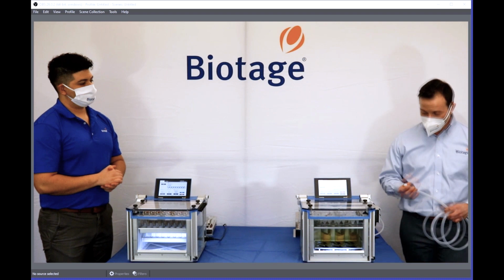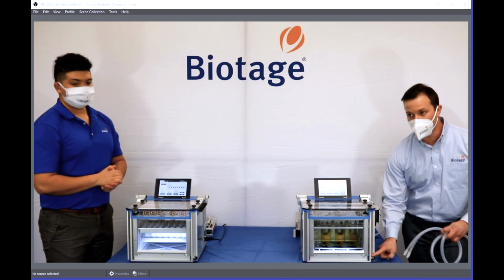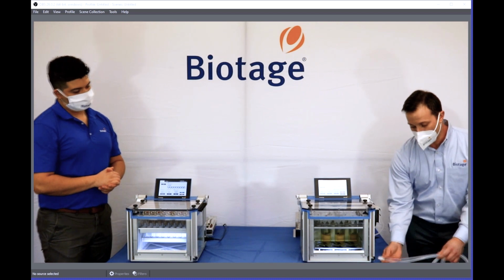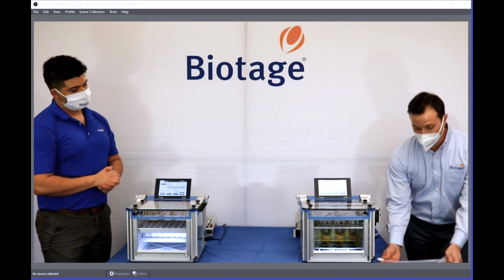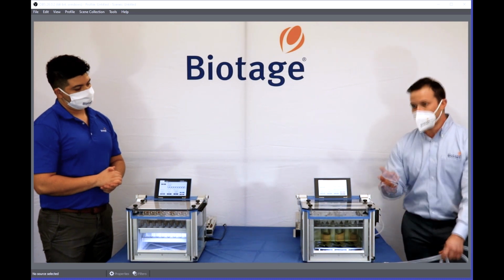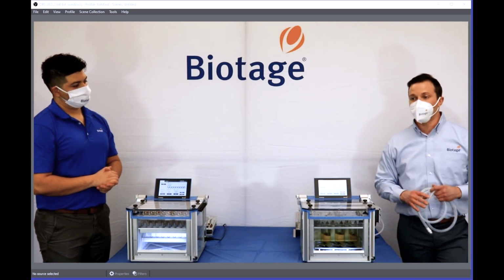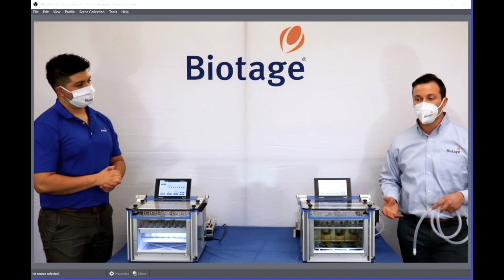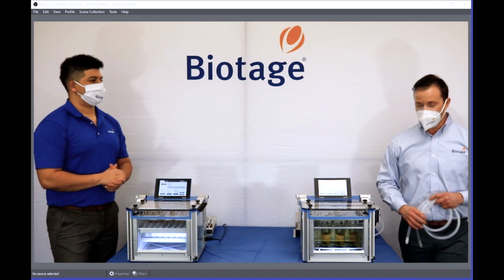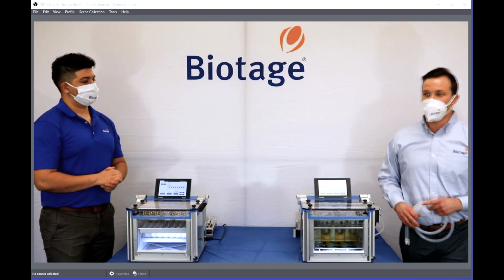You have a drain tube, and right here you have a quick connect, and all you need to do is pop in your drain tube and drain the bath, and it'll drain within seconds, and then you can replace it with fresh bath water on a routine basis. So no more picking the system up and draining it. It is all very quick and easy to do right in position at the bench.